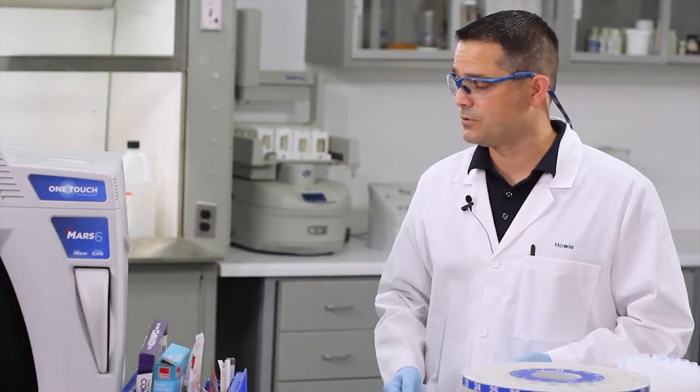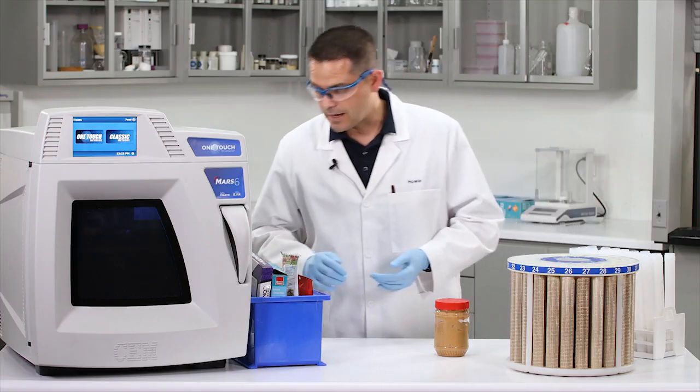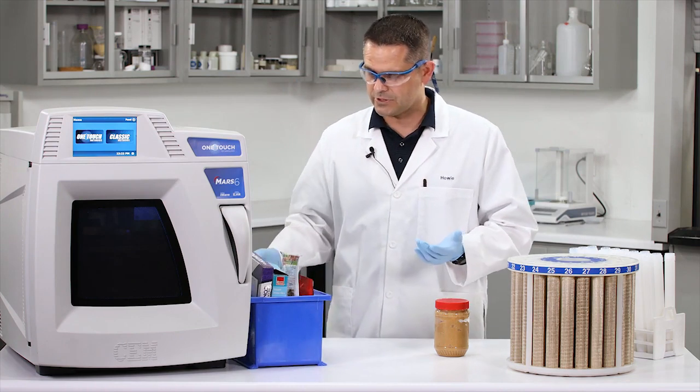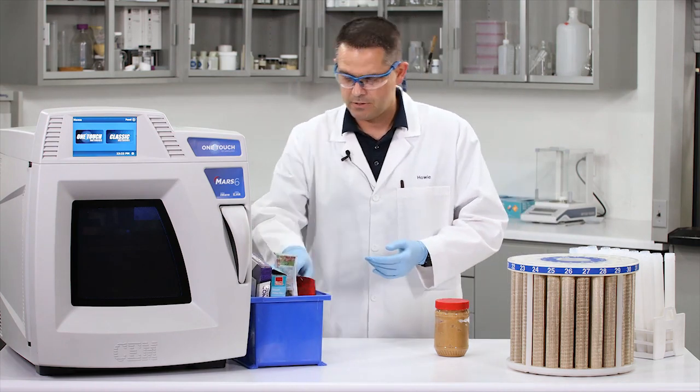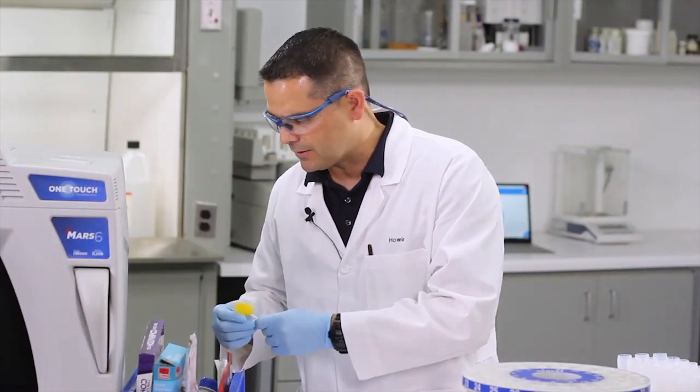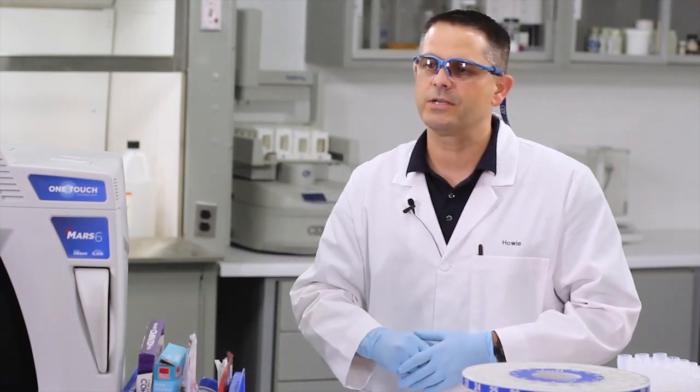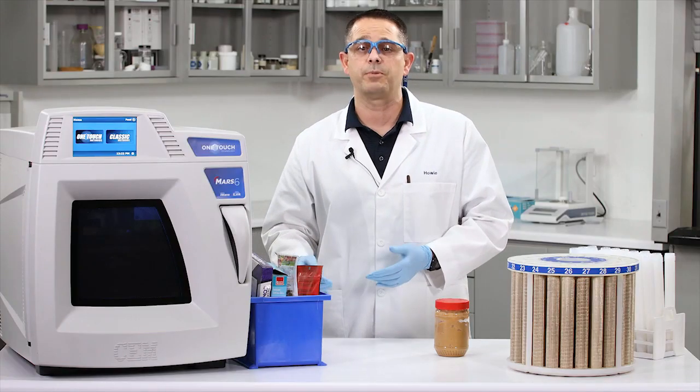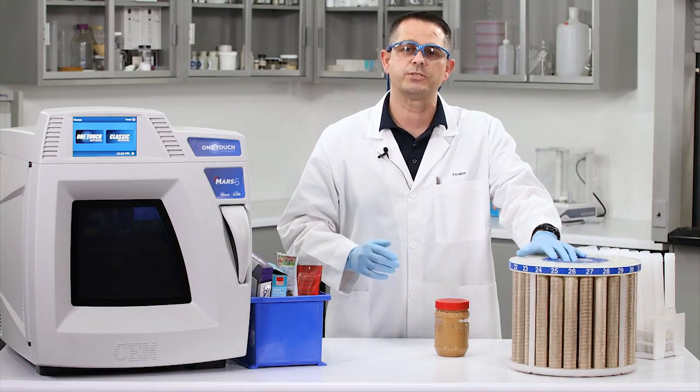First, before we go any further with peanut butter, let's take a look at some of the other foods that we need to digest. These were just brought to me. I've got beef jerky, American cheese, a lollipop, and a bunch of other things in here that we will digest in triplicate. Good thing I've got a 40-position Express vessel set right here.